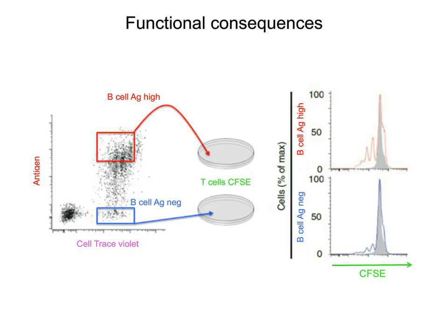And so now we can understand why some B cells can enter the germinal center because they receive a high amount of T cell help. It would be the red B cells, while some others, because they have lost the antigen when the mother B cell divided, lose the ability to interact with T cells and are probably pushed to differentiate into short-lived plasma cells.